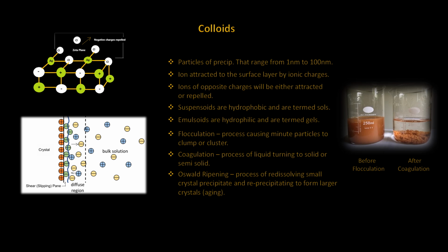This is known as Ostwald ripening, commonly referred to as just aging. There are other methods used to avoid a coagulated solution, and that is to add an electrolyte or a small amount of gelatin. Gently heating while stirring and a slow addition of the precipitating reagent appears to be best in avoiding a colloidal solution for most compounds.